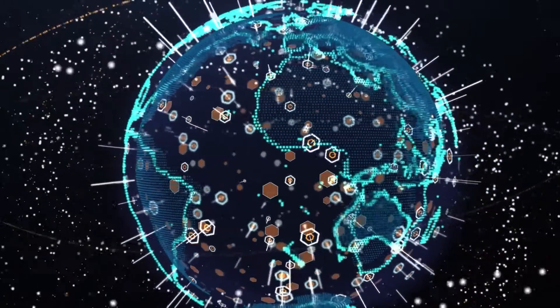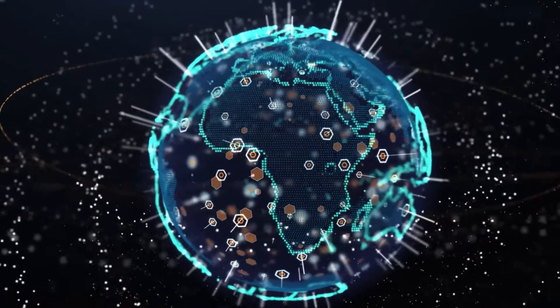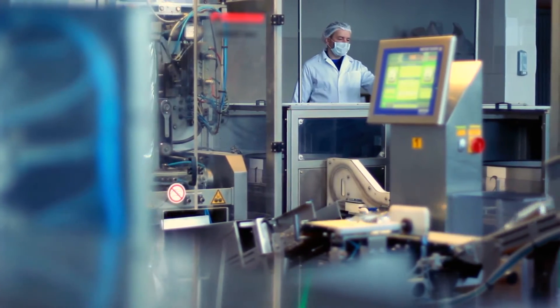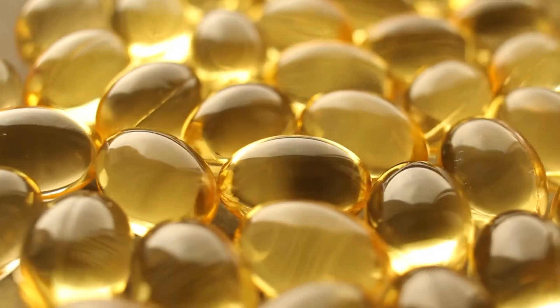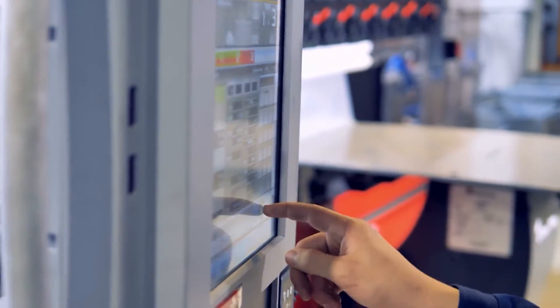Our global customer base spans a variety of industry segments from multinational pharmaceutical, generic, dietary supplement, and cosmetic contract manufacturers.